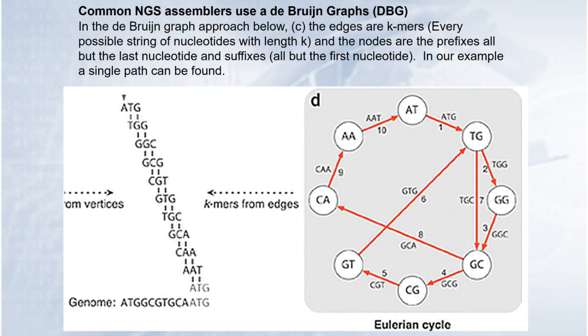Okay, and what they're primarily looking for is they take your data, your FASTQ files, and those FASTQ files are broken up into what are called KMers. KMers are simply DNA sequences of a particular length. And so in our silly example here, we have taken a sequence and broken it up into KMers that are 3 nucleotides long. Now, of course, we're only trying to build a genome that is very small, and so that's not a problem for us.